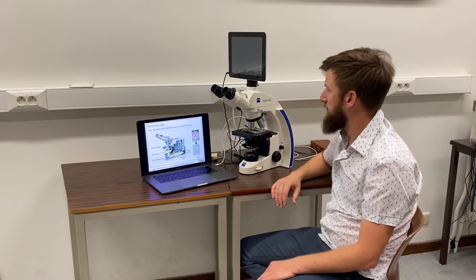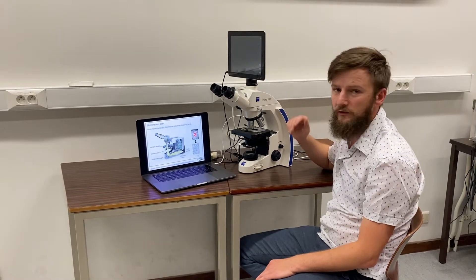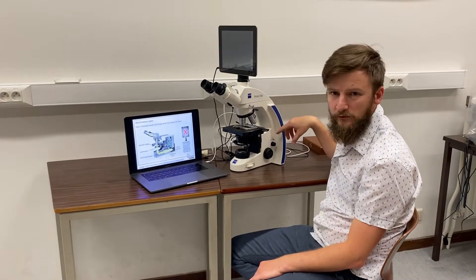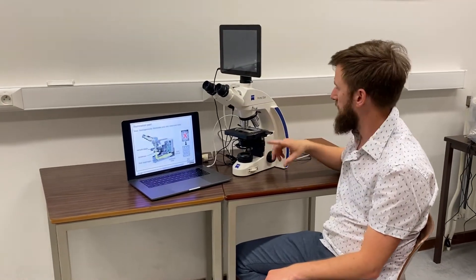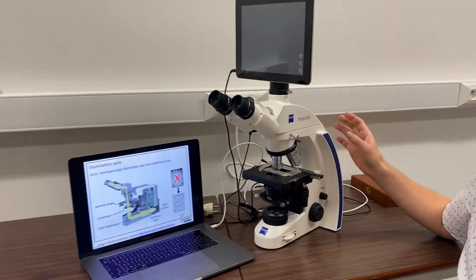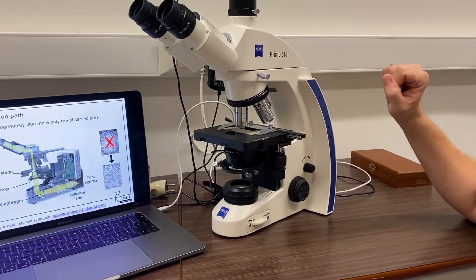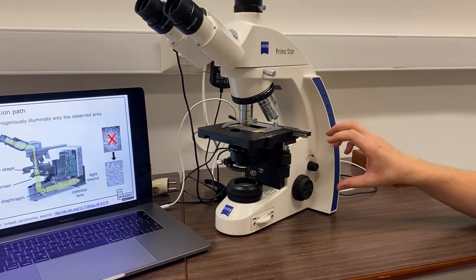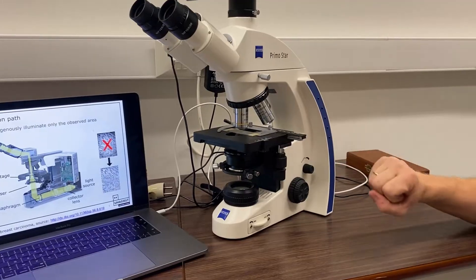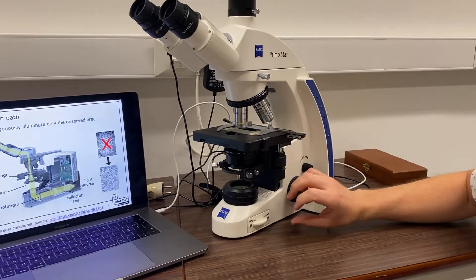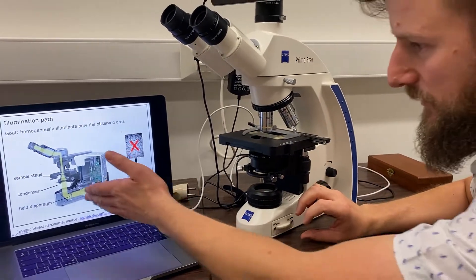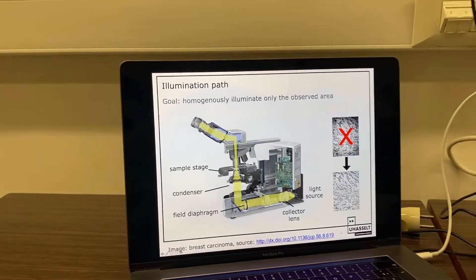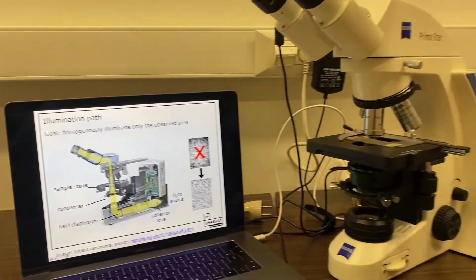In this demonstration I'll show you how to use a standard laboratory microscope. I'll start by guiding you through the different optical components. In white you see the microscope stand which holds together all the optical components. Inside this microscope stand is a lamp, and the light from the lamp travels through the housing, as you can also see on this scheme here, and it's reflected up towards the sample through a number of components.